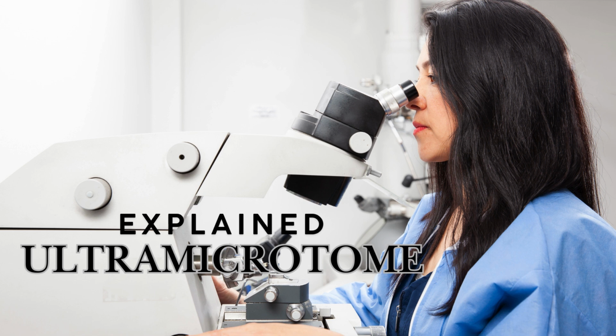Okay, so first things first. What is an ultramicrotome? Well, imagine you're a scientist and you're trying to look at a virus. But it's so tiny. You can't use a regular microscope. You need something that can slice things ridiculously thin. So enter the ultramicrotome, which is basically like a molecular deli slicer. It creates slices so thin that you can see them under an electron microscope.